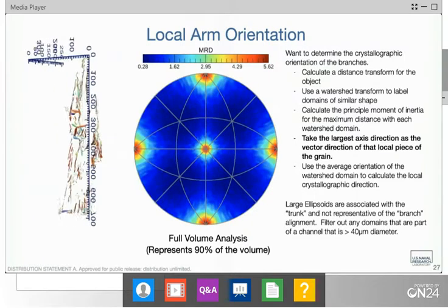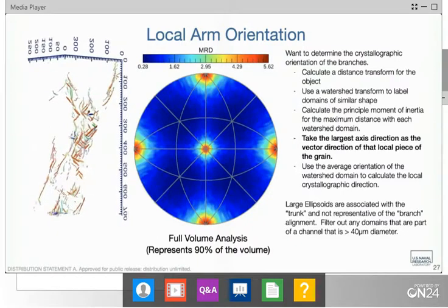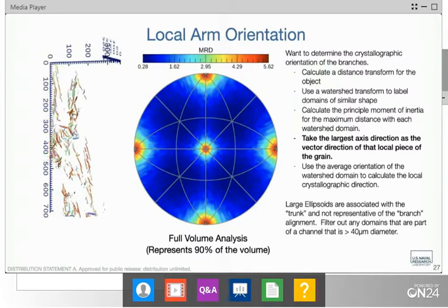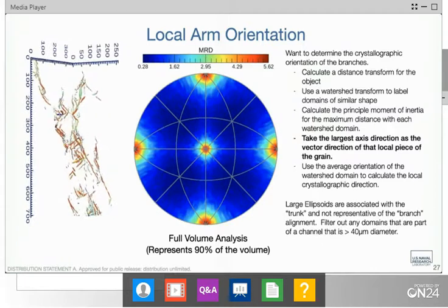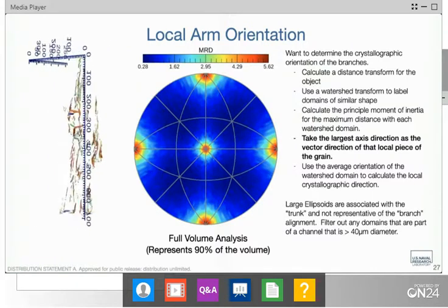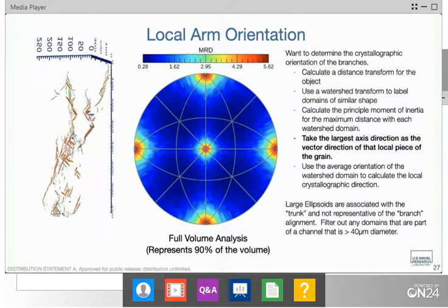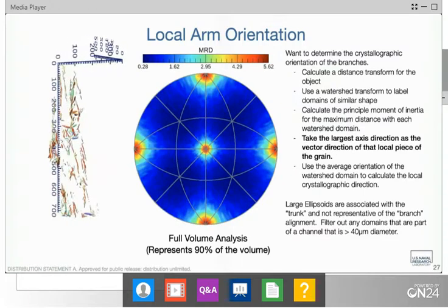So, I'll just give a little insight, certainly not necessarily in the scope of this particular talk. One of the things, if you look at Micrographs' work with dictionary indexing, is that there are some chances for doing a fairly good job of capturing the very small strains associated with that BCT microstructure that the traditional indexing does not capture. It's very difficult for traditional indexing to pull out those small changes in the lattice parameter. And I would say that's probably your best bet for most of that.